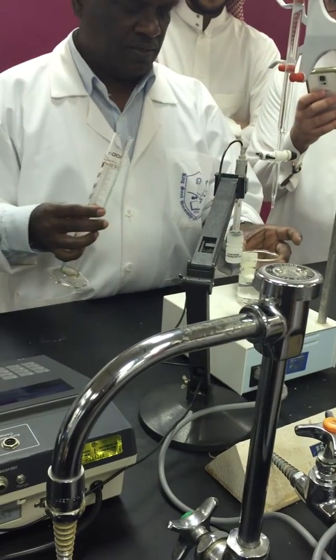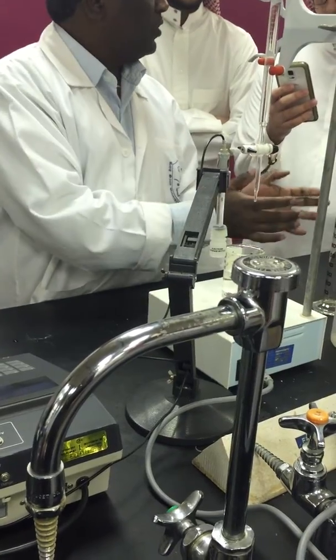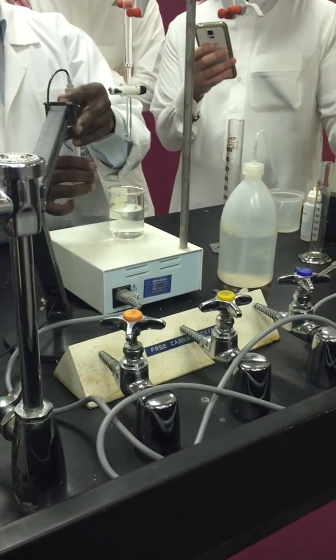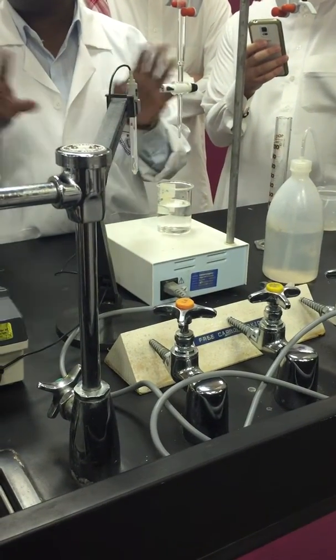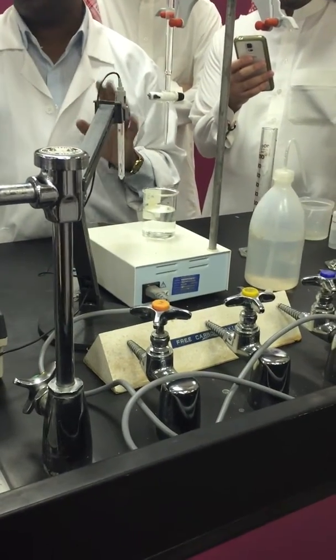The sample will be in the sample bottle, and it is written A1. It is always 100 milli, only for this experiment, not all. A1 and A2, pH and alkalinity, 100.